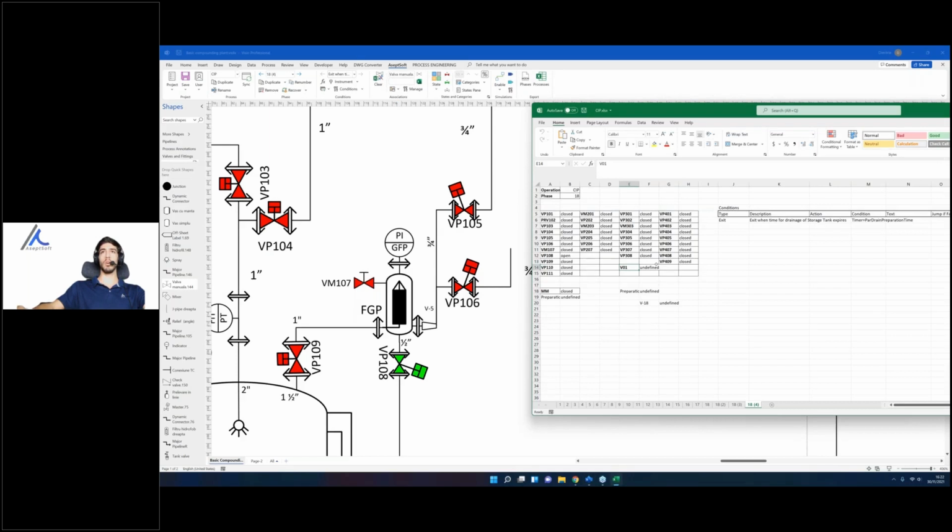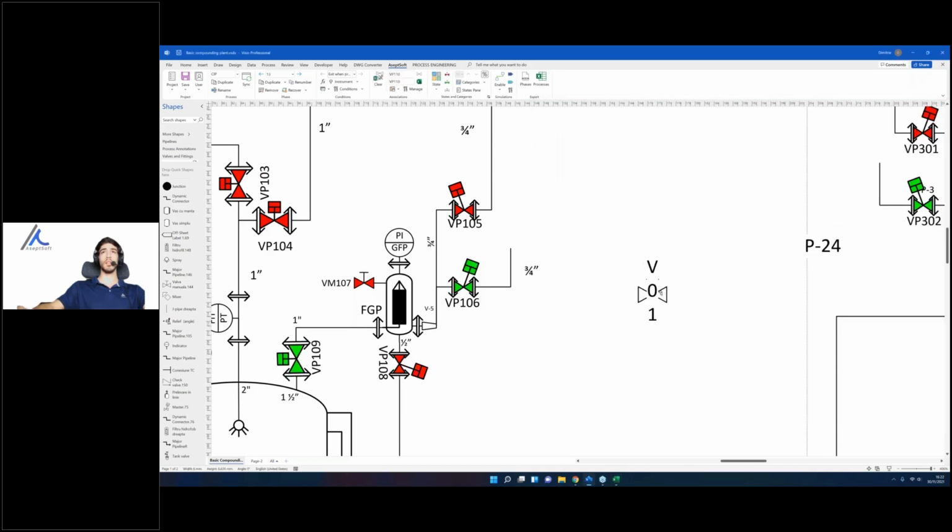It has been merged automatically with all the previous worksheets, and it appears everywhere. Now in the phases that it is relevant, you can go and open and close it. So it is merging automatically the process with your old work, all the new changes with the old work. Now let's remove this one because we don't need it anymore and clear it from the Excel, and it disappeared.